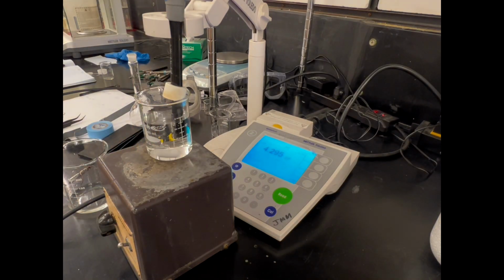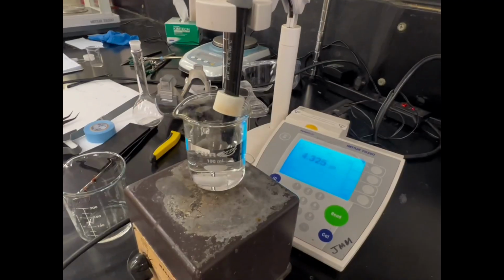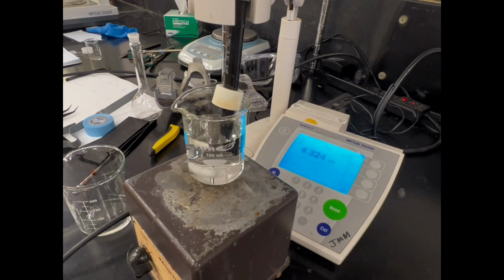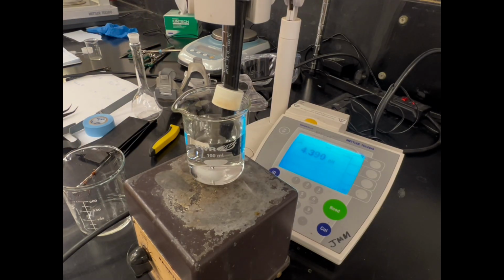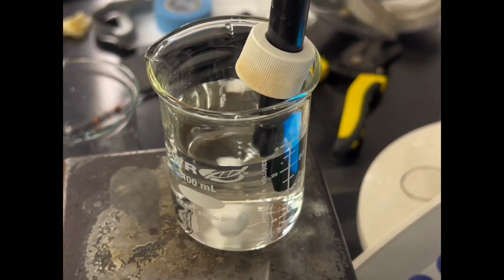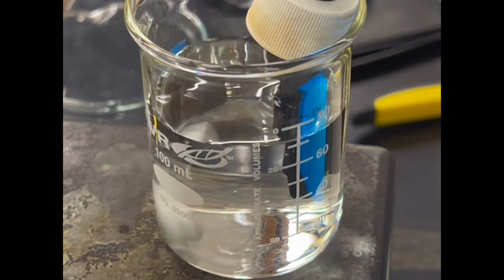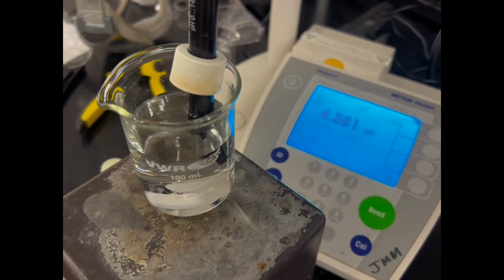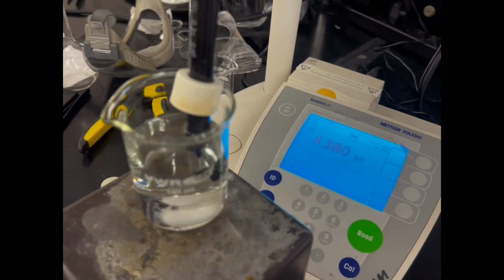Secondly, I would say let's leave some volume space for the pH adjustment later, because the solvent we use could also help us adjust the pH. The water has a pH around 7, which could help us lower or raise the pH. And in this case, we should use ammonium hydroxide or sodium hydroxide to raise the pH, or use sulfuric acid to lower the pH value.